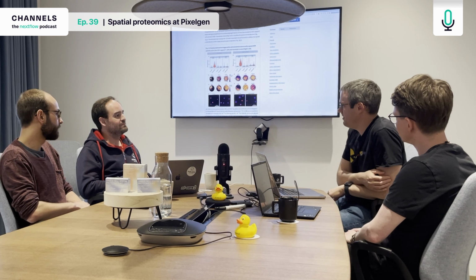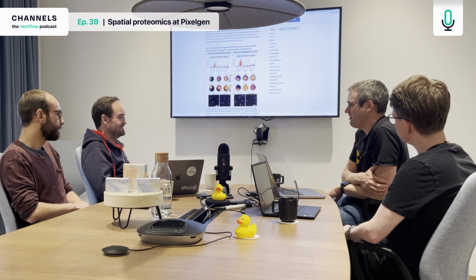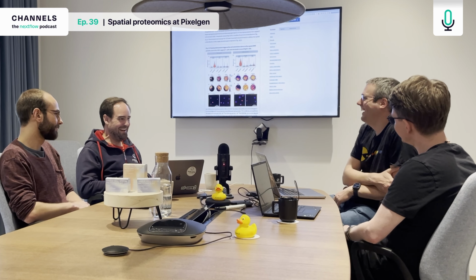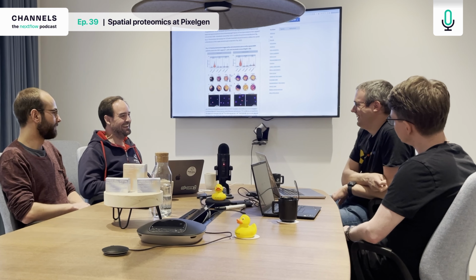I was going to ask you that. Did you say 80 proteins all at once? Yeah. I mean, you can't do that with a microscope either. No, not at the same time. Easily. You can spend a lot of hours in front of the microscope if you want.